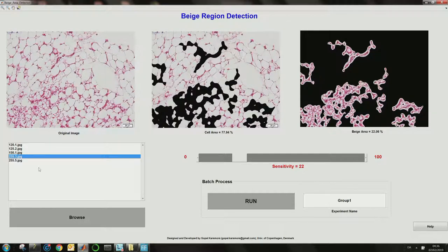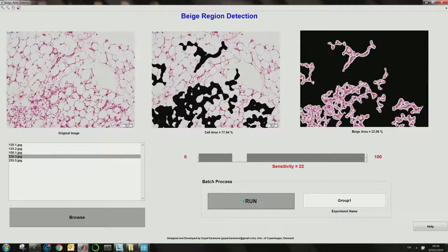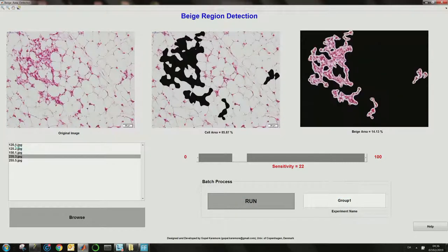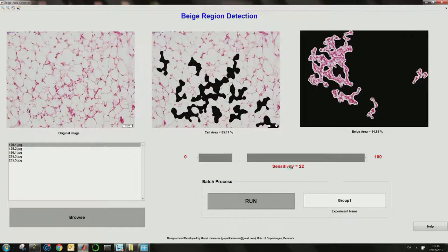I want to process all of these images, group them, and call it group one. I go to the batch process toolbar, enter the experiment name as group one, and simply click the run button. That will process each individual image within the list box using the selected sensitivity threshold.